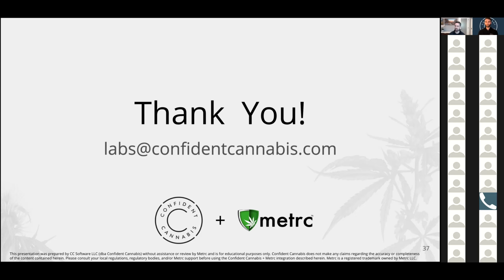But if you don't do that and they leave, then you have to call them and tell them, hey, look, I rejected the transfer. You got to go back to your office and create a new transfer for this weight because it was wrong, right? So you have to kind of coordinate with them. But yeah, you can reject the transfer in Metrc if it's way off. Like I said, there might be some regulatory wiggle room there. If it's like plus minus 10%, you can enter a different weight there. But better safe than sorry, probably just reject it.